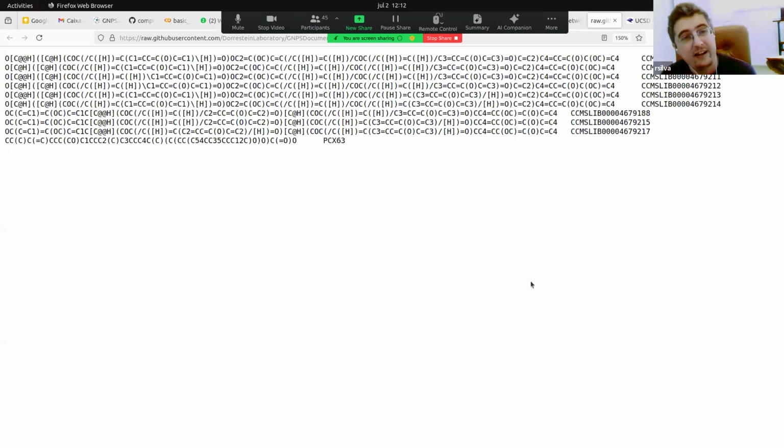This is very powerful because I'm going to show you some of our publications and our ongoing work. It basically allows you to search a given structure on thousands of nodes. Generally, there are lots of people that still do mass spectrometry. They calculate the exact mass and they go to SciFinder and they do this manually. So you can do that very fast and at large scale.